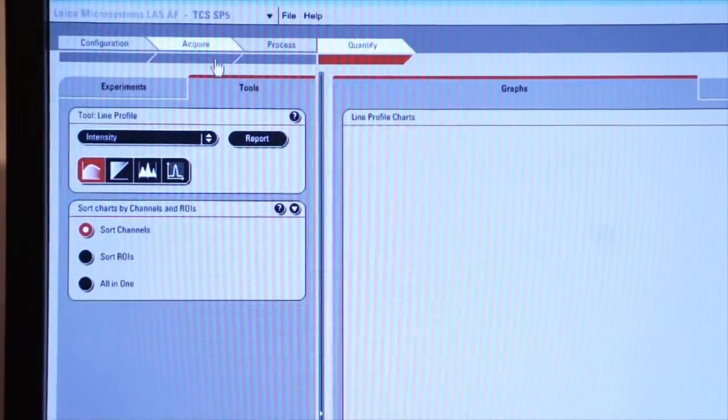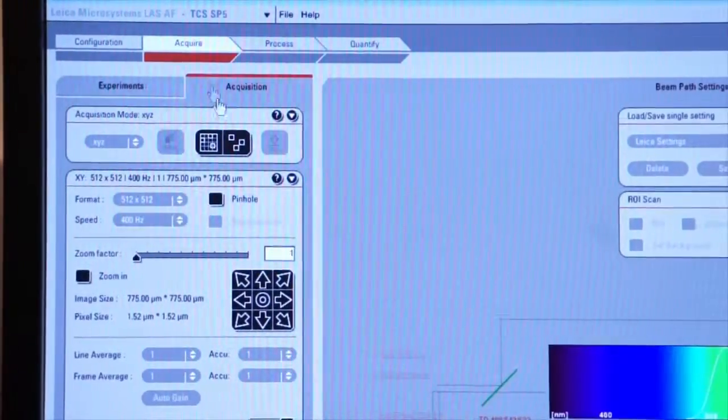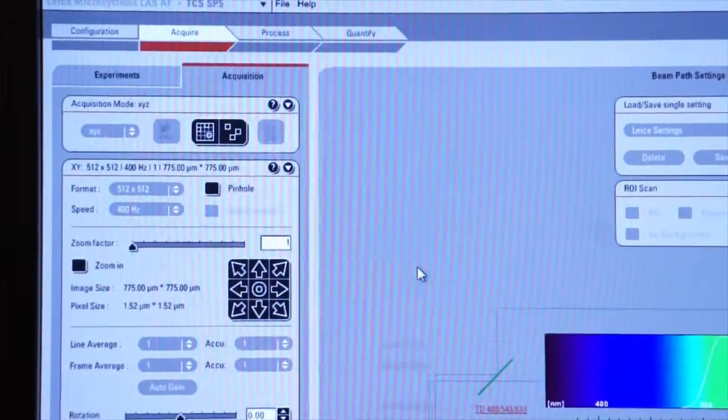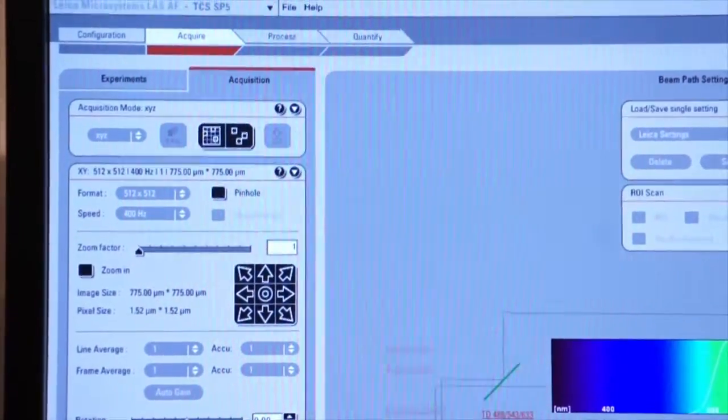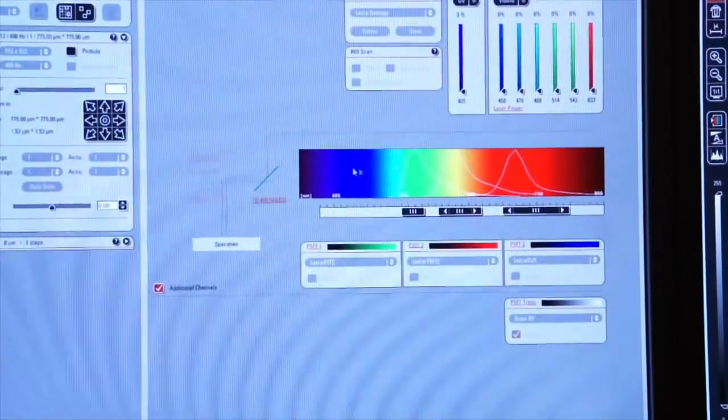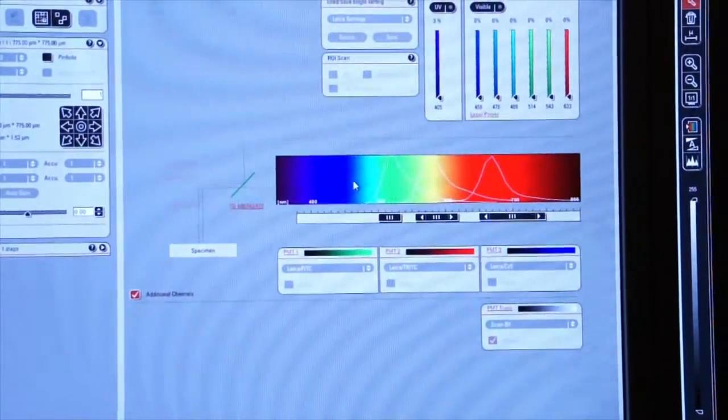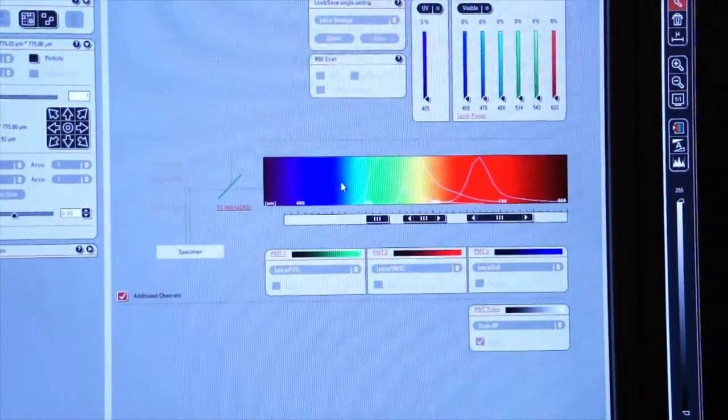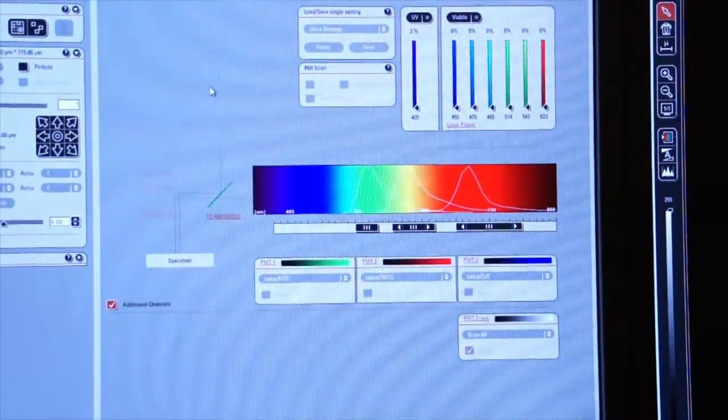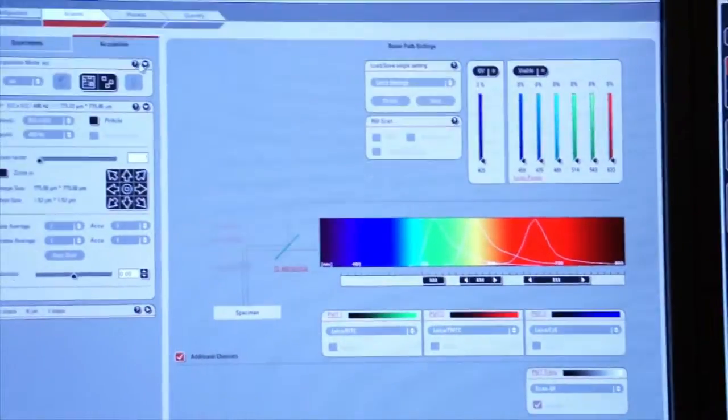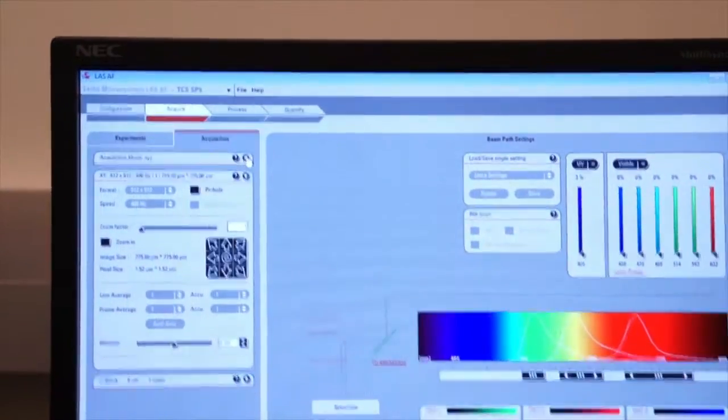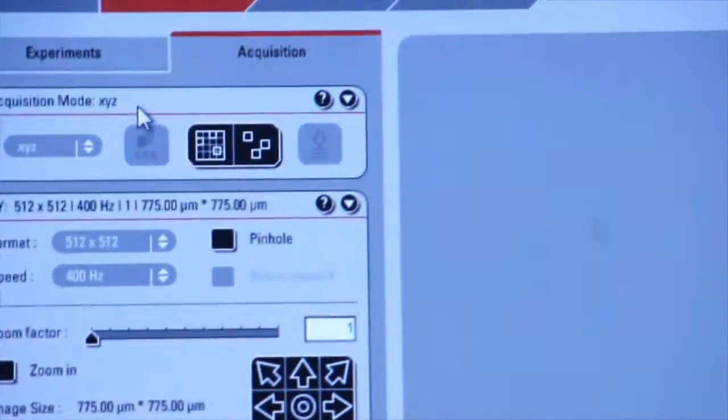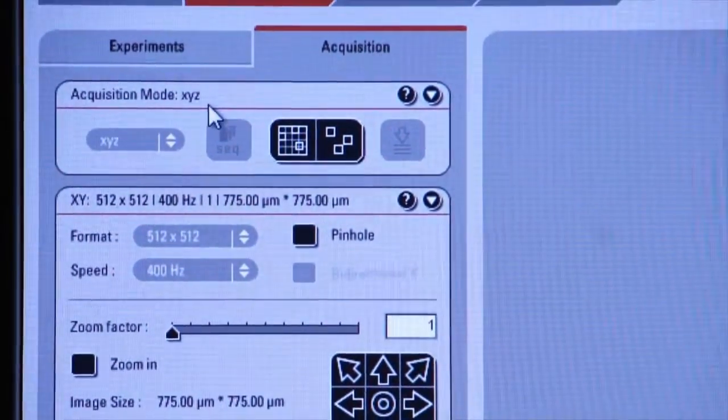But for right now, we're going back to the Acquire tab. As you can see, we default to the visible spectrum. We're going to be selecting our laser lines here in a second and beginning our imaging. Remember that we have an Acquisition Mode tab, which should always be set for XYZ. We're always going to work in the XYZ mode.